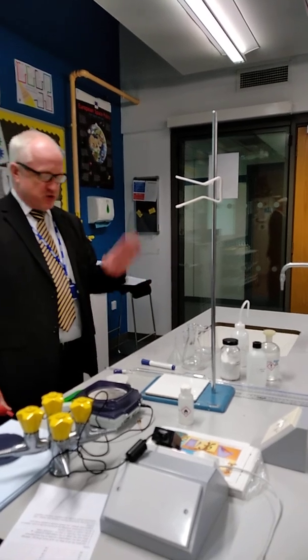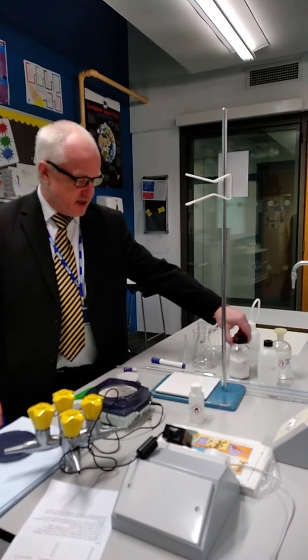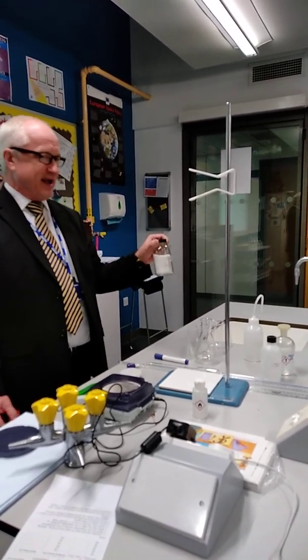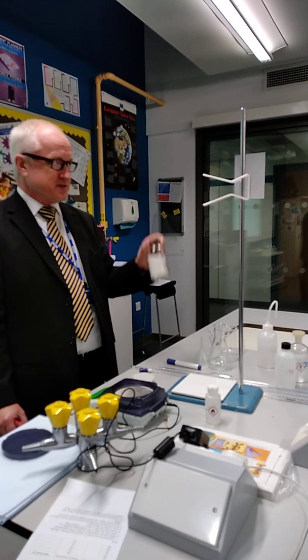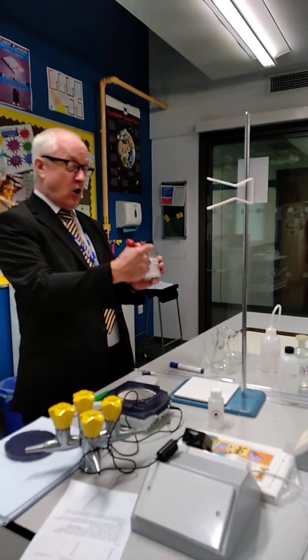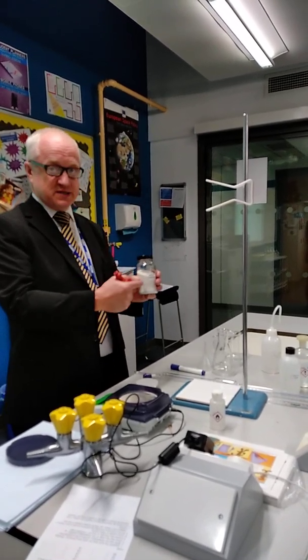We're doing a back titration of a solid. We're using sodium carbonate, and it's hydrated — there are a number of water molecules attached to every ionic formula of the sodium carbonate. So we're going to try and determine the amount of water that's attached to this.